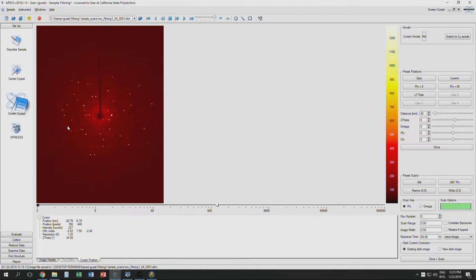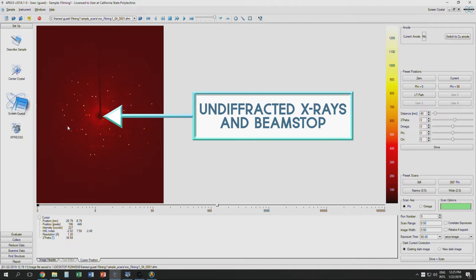In the center is a bright spot, or dark spot, which is where undiffracted x-rays strike the detector, and you may also see a vertical shadow, which is the beam stop.